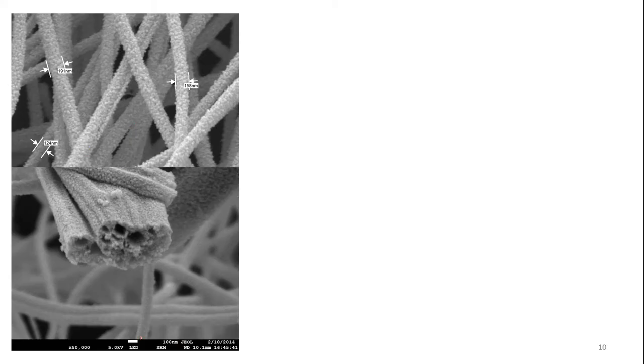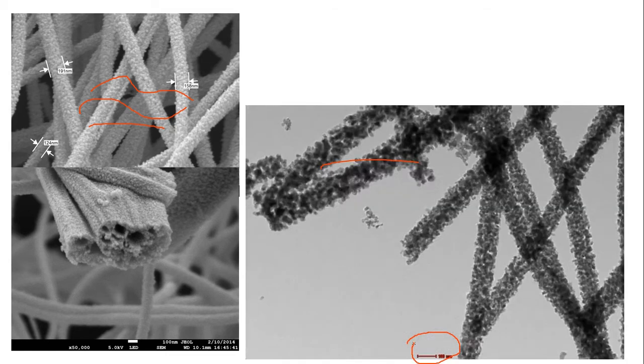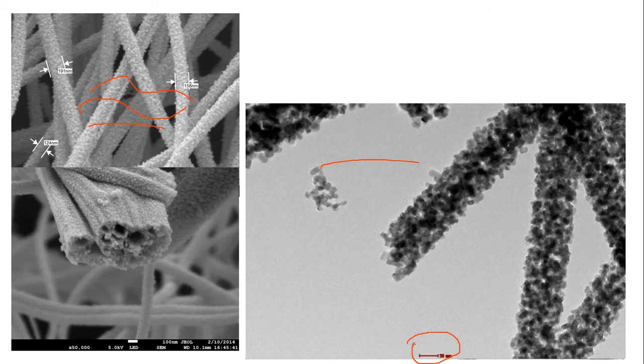Now, let us see transmission electron microscopic images. We just take a very thin sample of this material and focus. Here you can see that it is now at 200 nanometers, and this is now 100 nanometers. We further zoom here. Now, this is 50 nanometers.